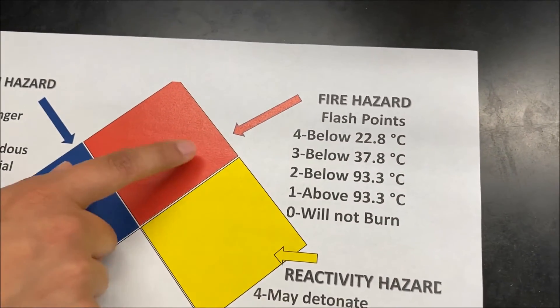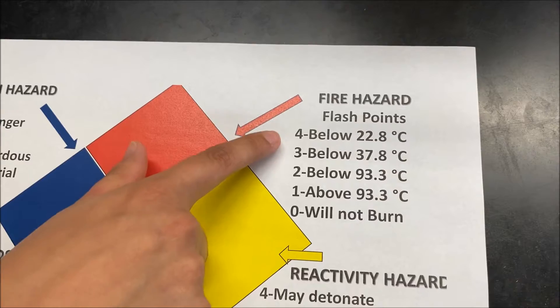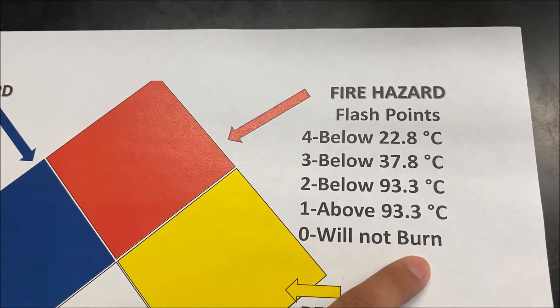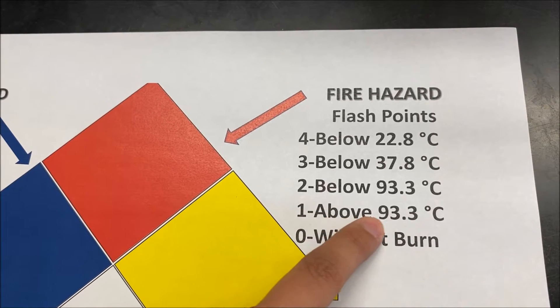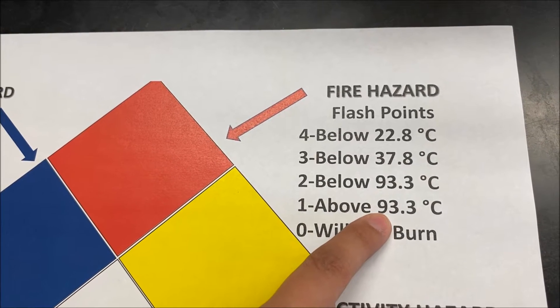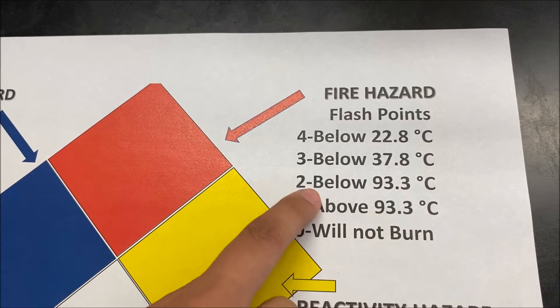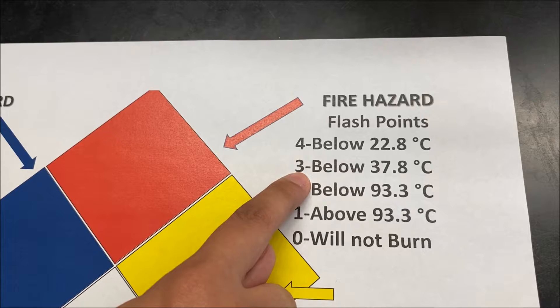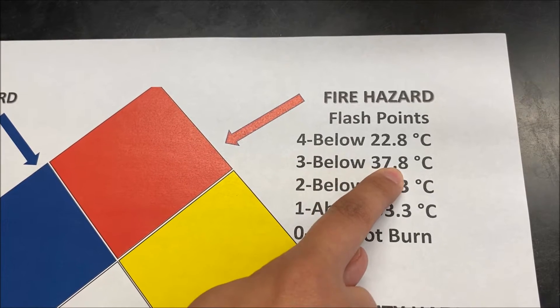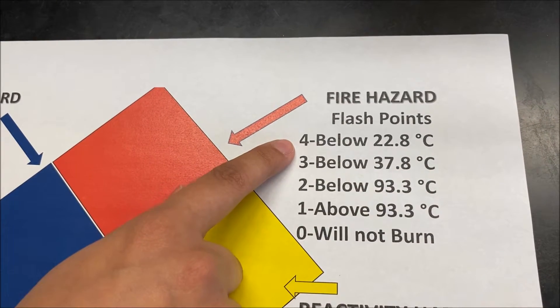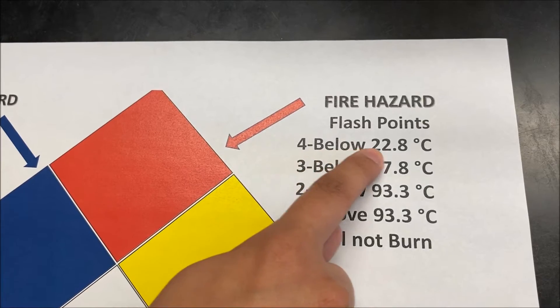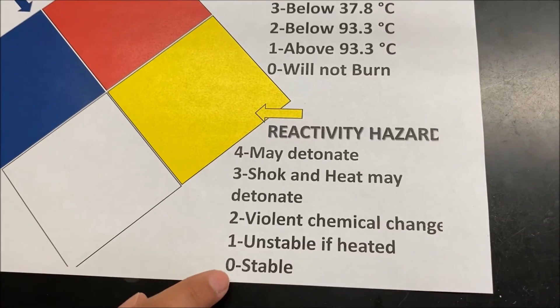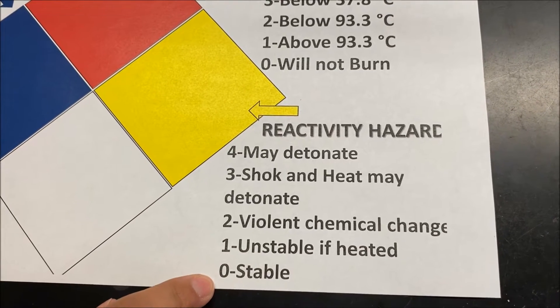For the fire hazards, the numbers show the flash points of when a substance is flammable. 0 means it will not burn. 1 means it requires above 93.3 degrees Celsius. 2 means it ignites below 93.3 degrees Celsius. 3 is below 37.8 degrees Celsius. And 4 is below 22.8 degrees Celsius. The reactivity hazards start at 0, where the chemical is stable.